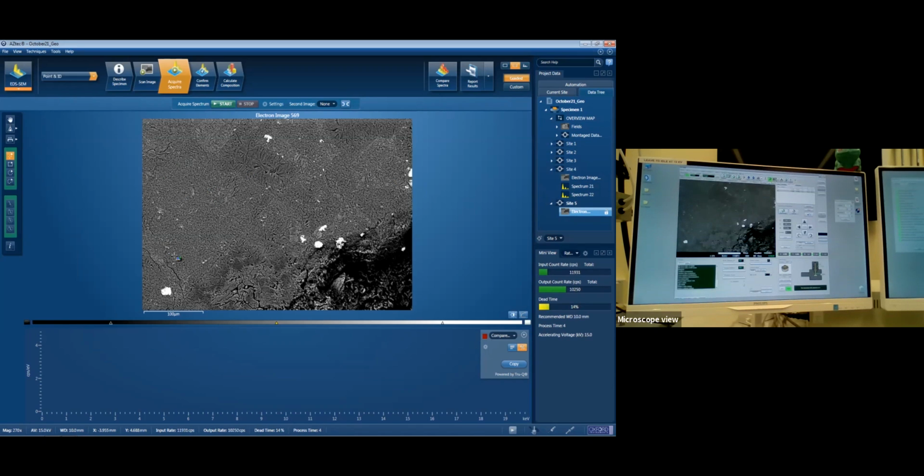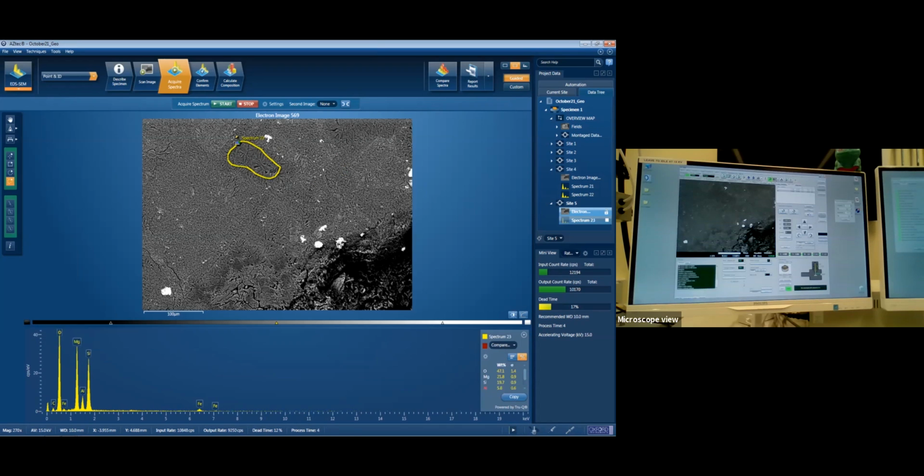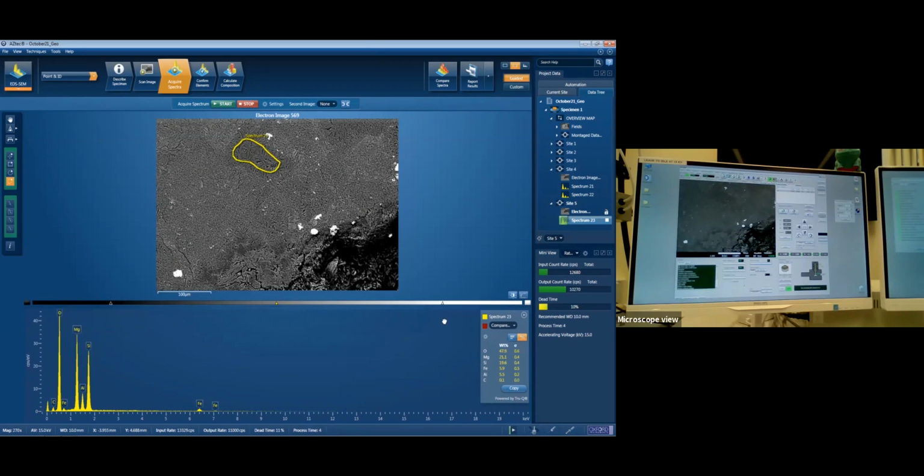So what we've got is this kind of middling grey, we've got a couple of lighter grey bits, we've got this dark grey thing up here. So what I'm going to do is a fun little freehand region, which will be tough because I'm not very good at drawing with a mouse. So we're going to draw around the middle of that darker grey blob. And it will now make a spectra for the whole middle bit. If we slide that up so we can see the whole thing.